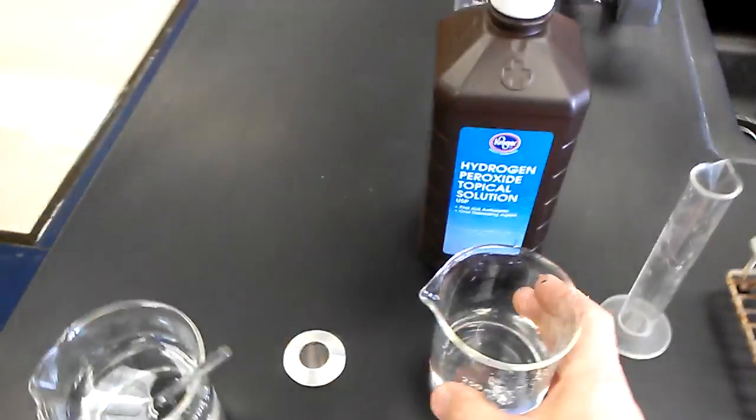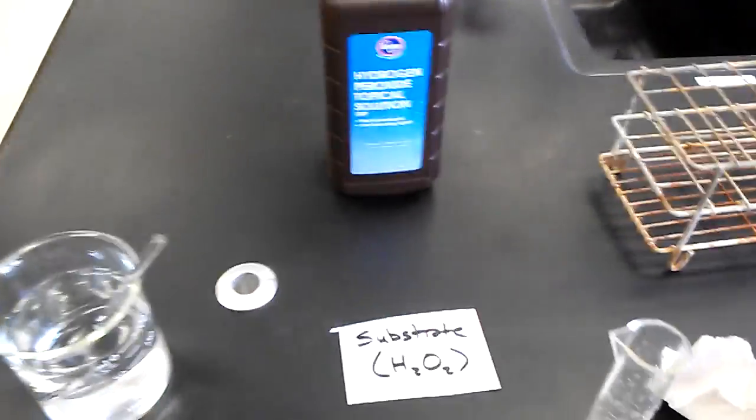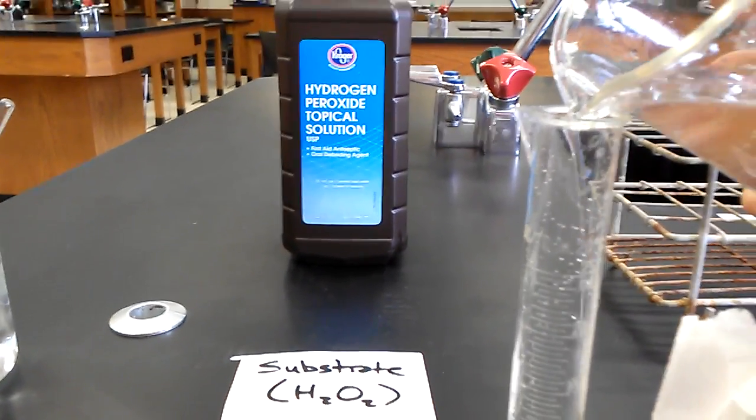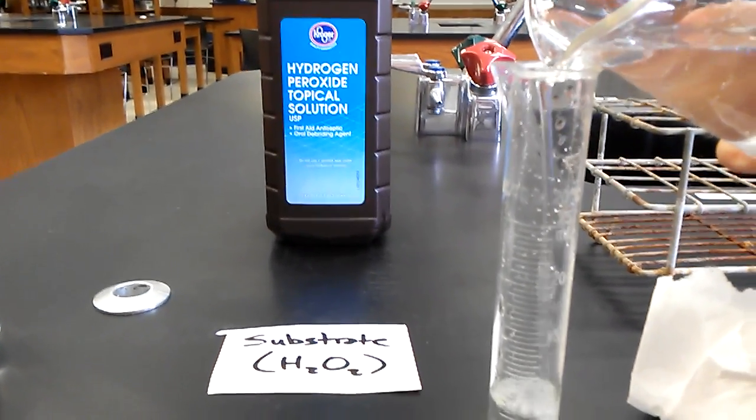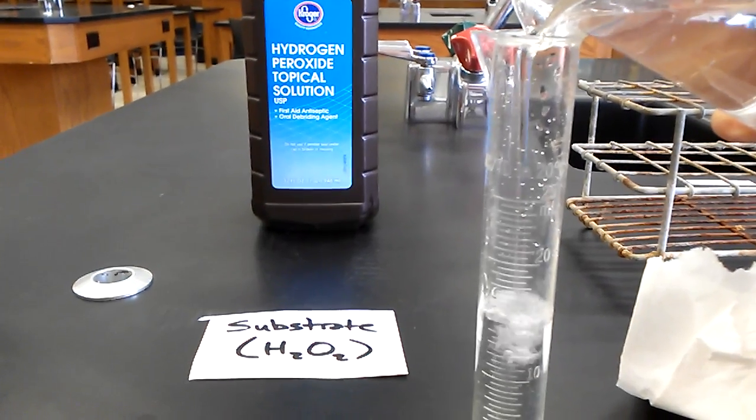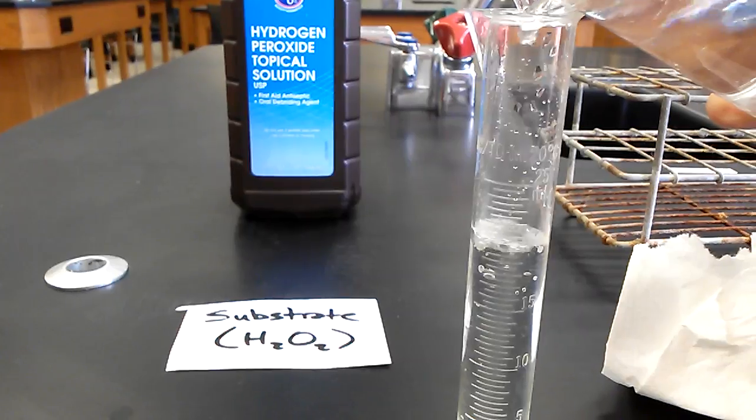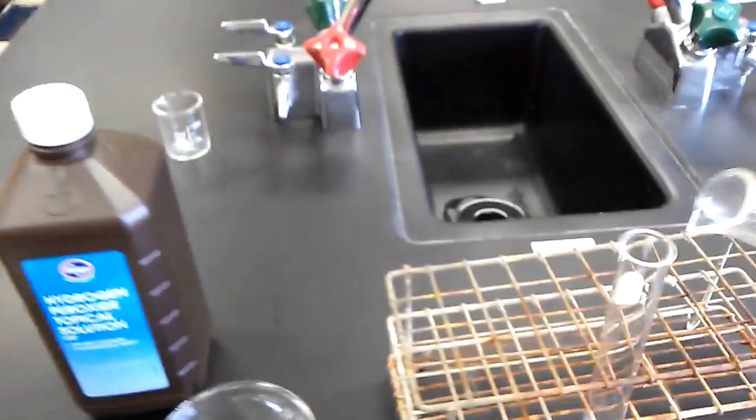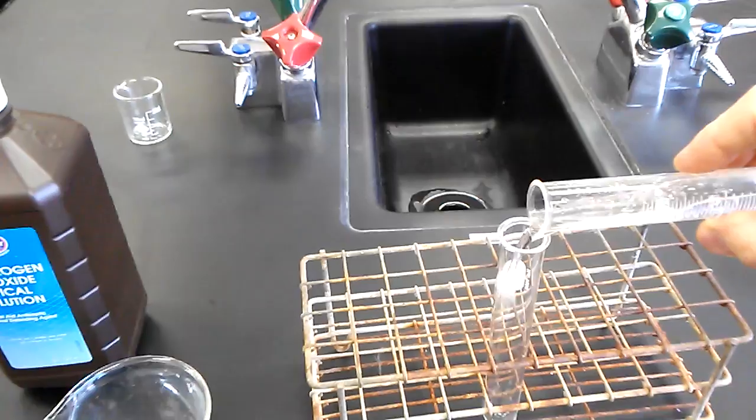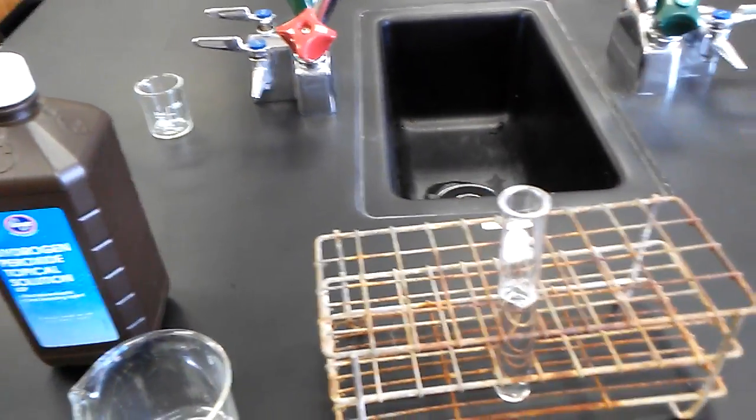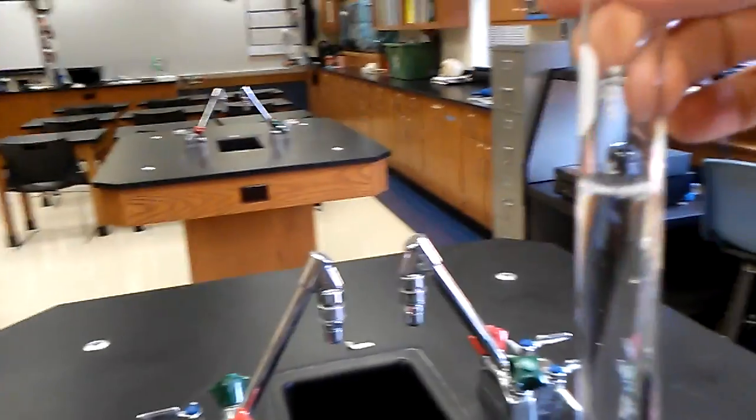So let's pour our hydrogen peroxide. We need 20 milliliters. And this should fill the test tube about two thirds of the way full.